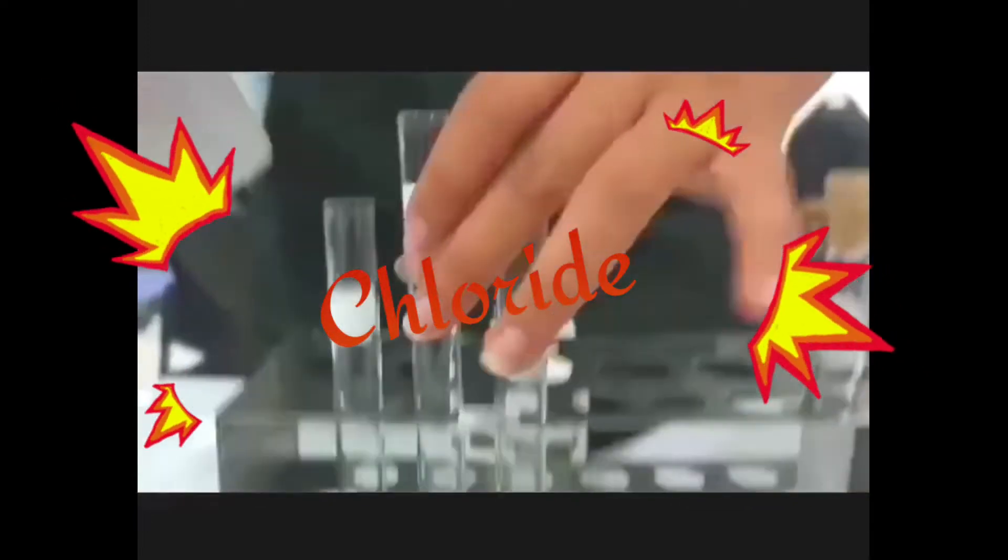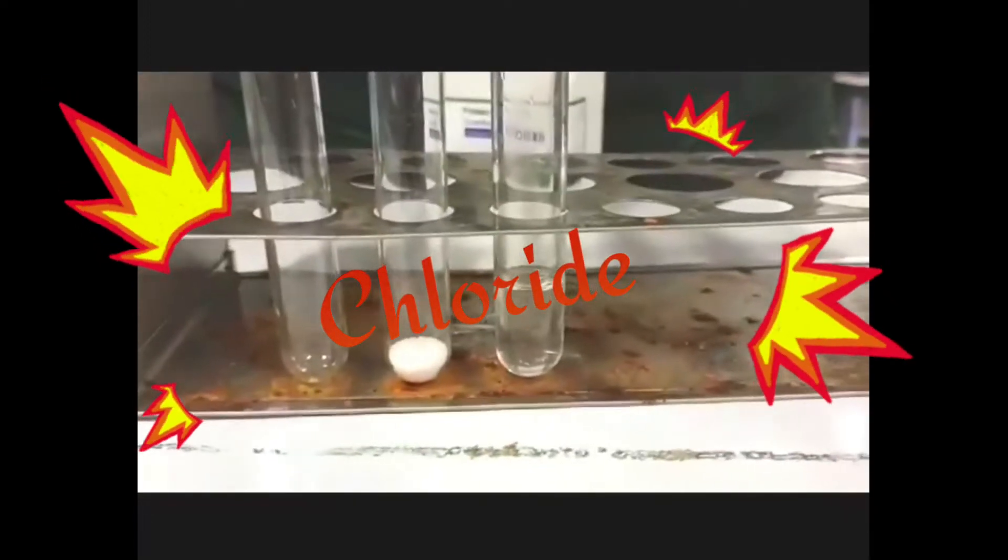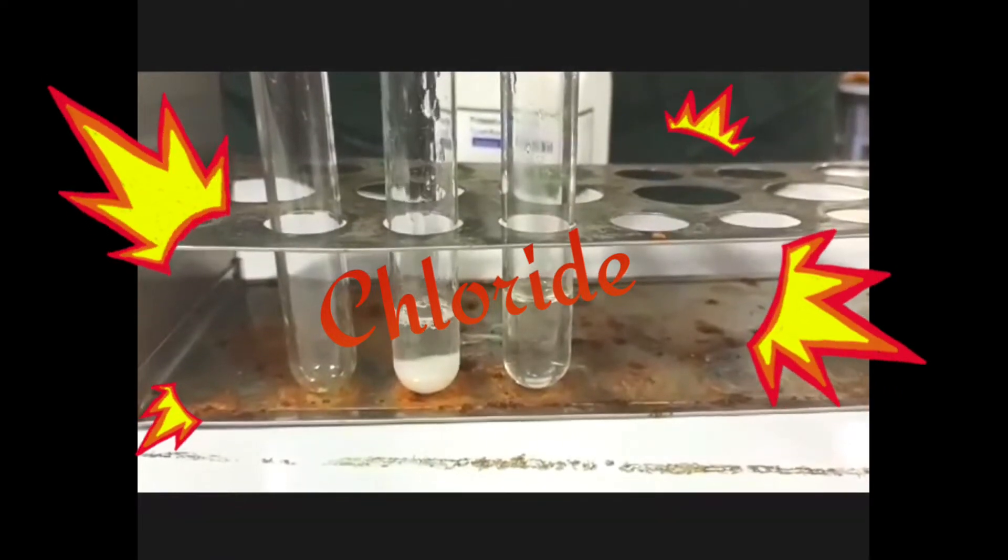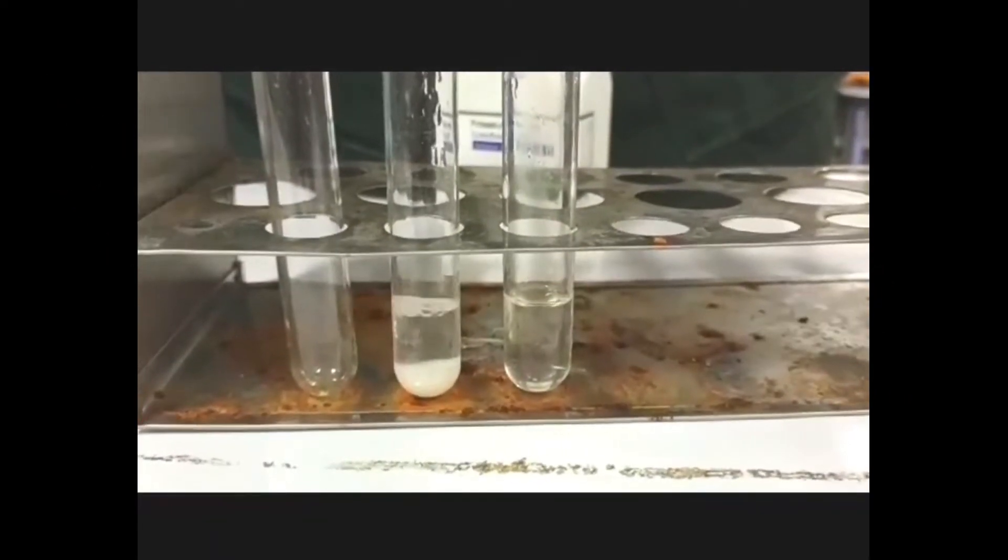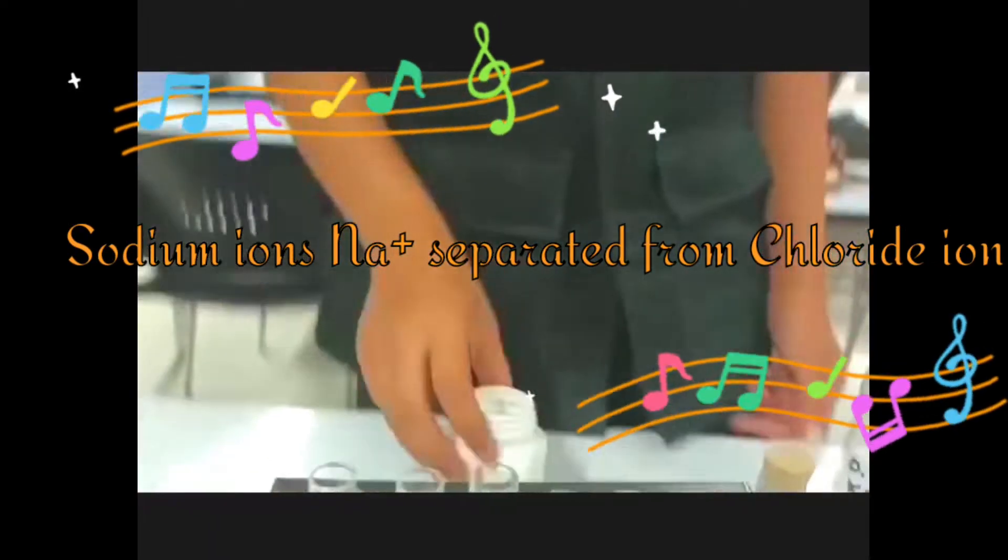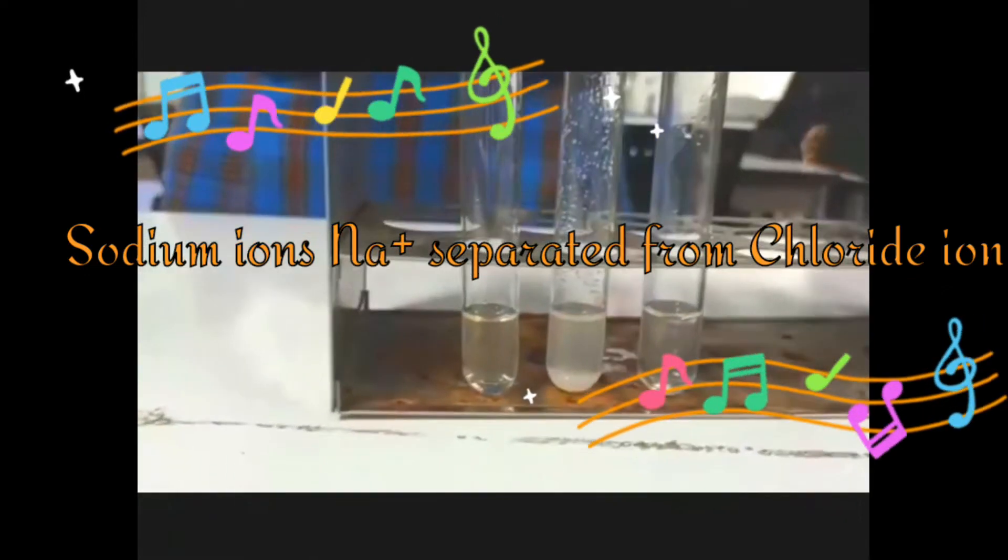We add a bit of water so we can make a solution. As we do so, the white powder dissolves. You might need to shake it a bit. As you can see, it has separated the positive sodium ion from the chloride ion so they can move around freely.